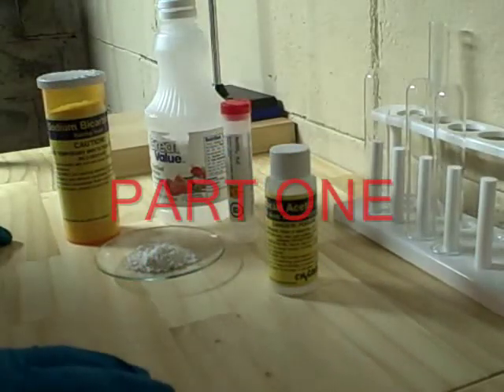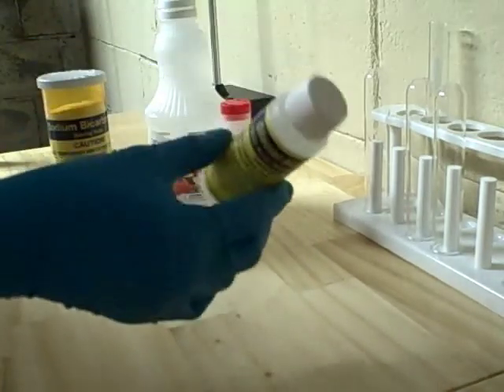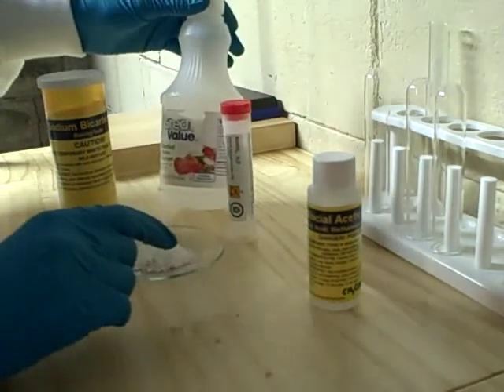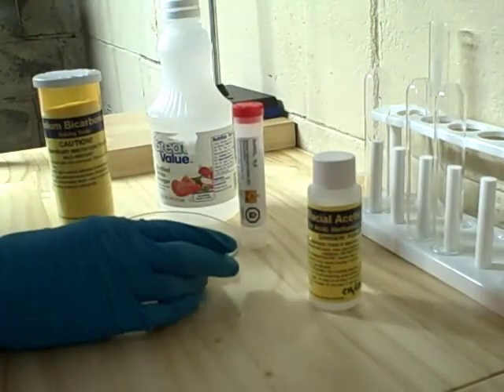Hello everyone, this is Science Hideout, and today I will be showing you how to make glacial acetic acid out of these few common chemicals: vinegar, sodium bicarbonate, sodium bisulfate, and sodium acetate.